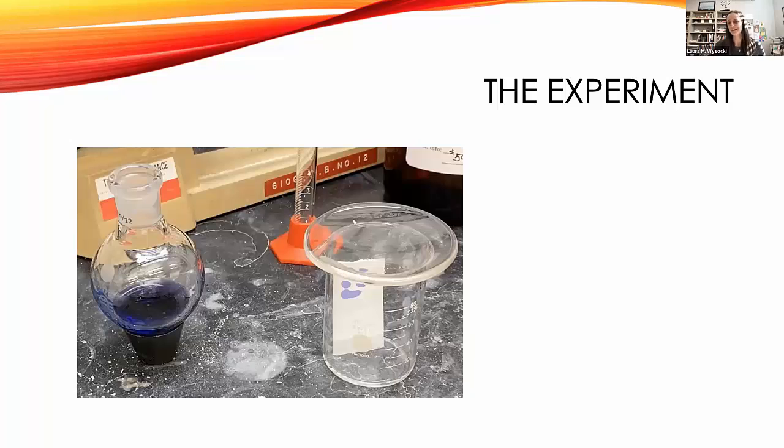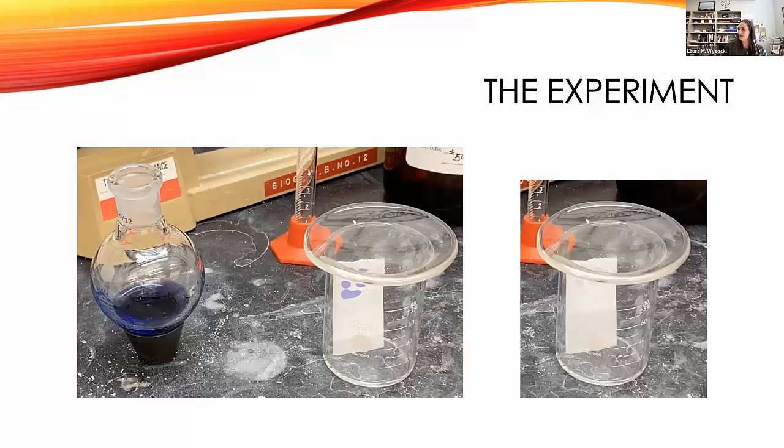Forgive my smiley face there, but they run a TLC, but not the traditional TLC to see what's happening in a reaction. What they do is they just spot a pattern on a TLC plate and then put it in some ethyl acetate, and they find that it retains the blue color on the silica gel, but when it's in an environment of solvent, something a little bit different happens. It becomes colorless.